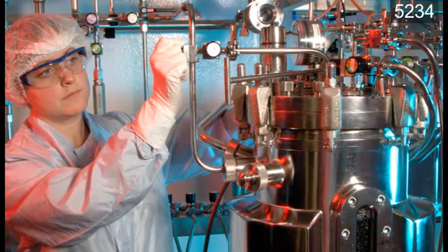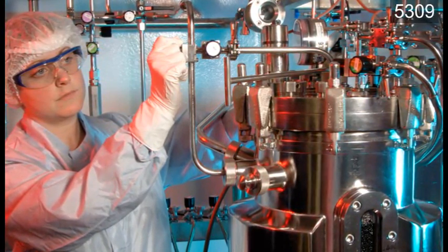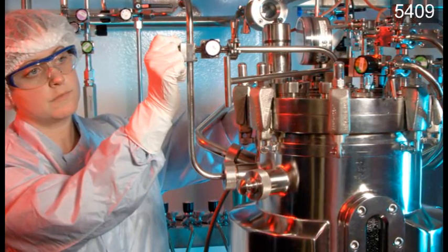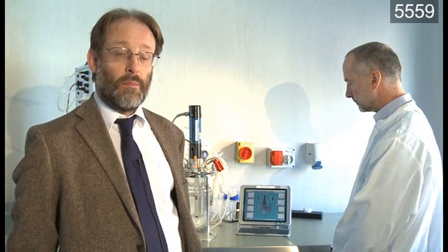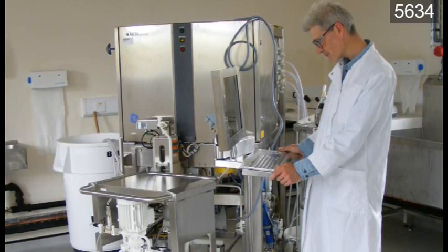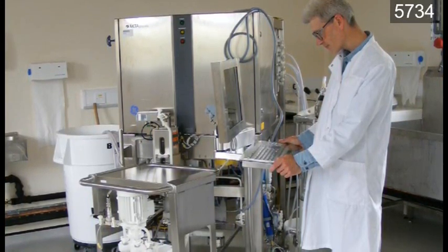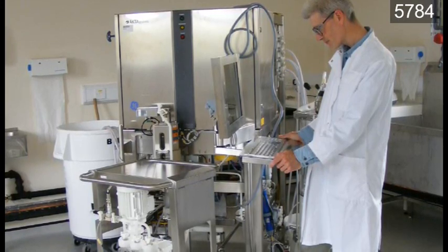Once we've established fermentation conditions, what we then have to do is look at how we purify the product of interest. We have an extensive downstream processing capability which we can use to maximise the yield of the product of interest and to increase the purity to levels acceptable to regulators. In the developmental facility, we're aiming to produce a product of high purity and high yield and to consistently produce that.